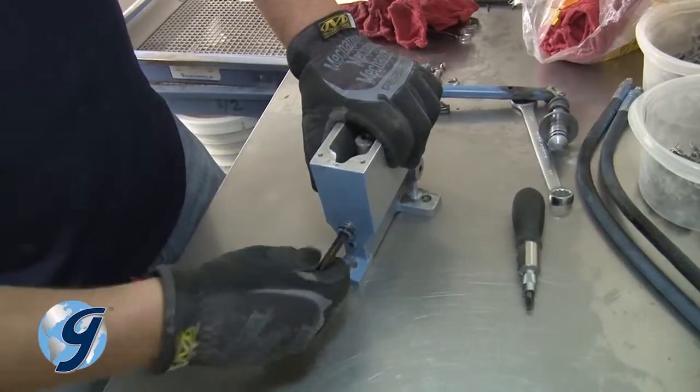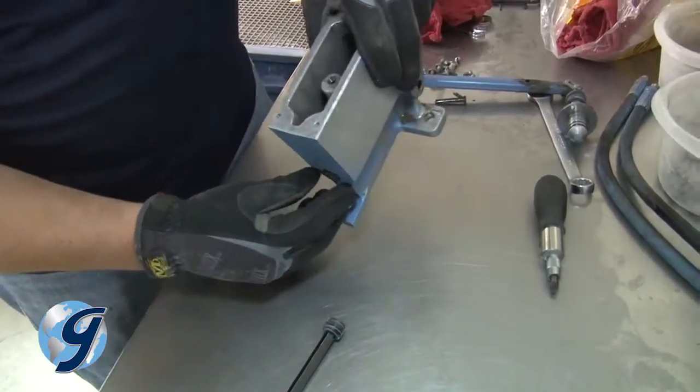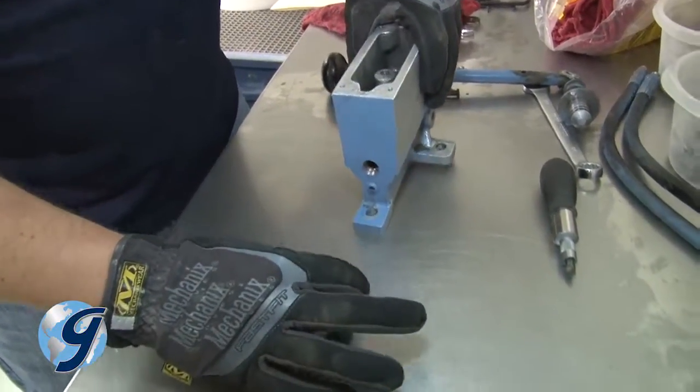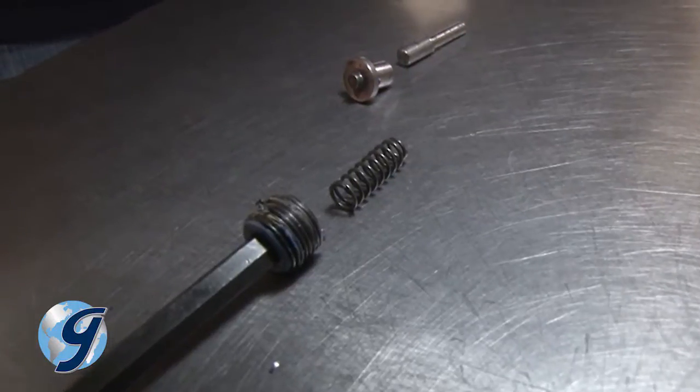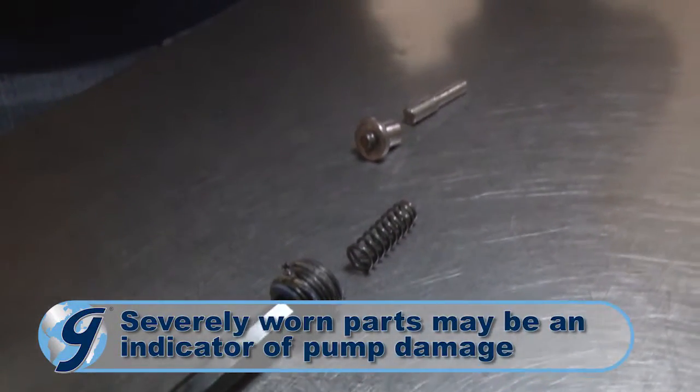Now remove the pressure release plug, which is the largest plug on the pump. The pressure release spring and thrust pin with O-ring should come out easily when the pump is tilted. Inspect these items for wear and set them aside. Severely worn parts may signal further damage to the pump itself.